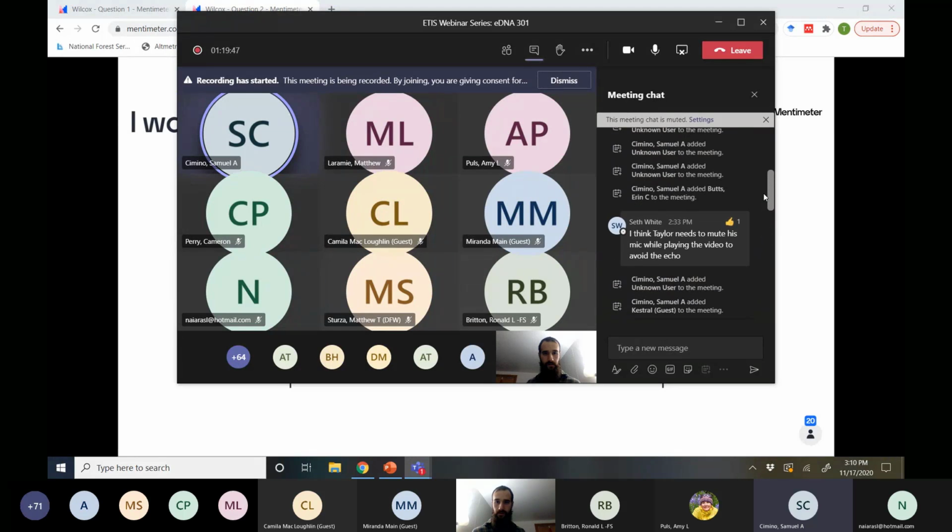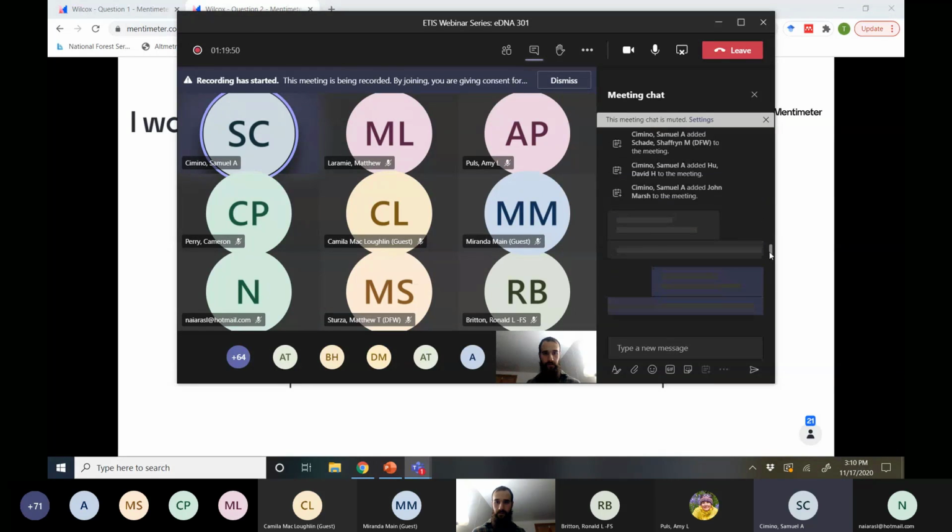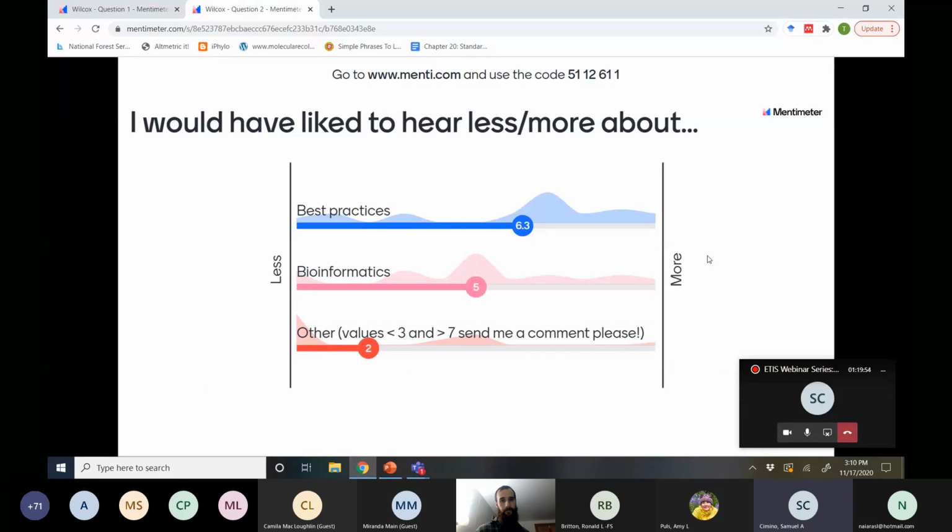But first question that we have from Damian Menning: what factors do the primer development programs assess? Yeah, so each program is going to have some sort of a rule set for imagining what would result in amplification versus not result in amplification. If you give it a list of potential templates, it's essentially going to say this is something that will be amplified by these primers, or this is something that will not be amplified by these primers. And it could be a little bit more fine scale than that. For example, the DECIPHER package is one that I use quite a bit, and it tries to actually say this is what our relative amplification efficiency is going to be for each of these templates. So you're going to have some value between 0% and 100%. So you're actually able to assess not just will this amplify, but how well is it likely to amplify.